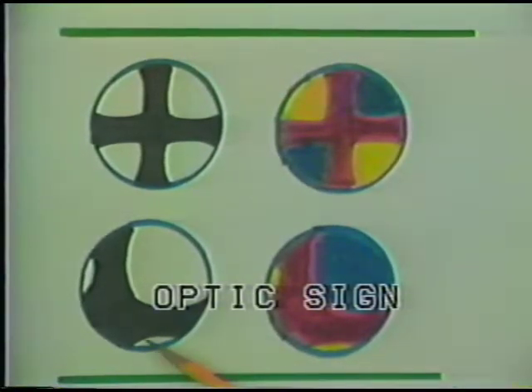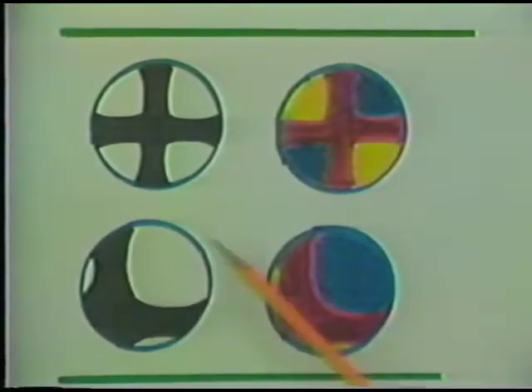If the figure is uncentered, then you want to do the same kind of trick as we did before: rotate the figure until we're looking mainly at the northeast quadrant in this particular case, and use the accessory plate, again the gypsum plate indicated here. The addition of colors, a change to blue color, indicates that this mineral is positive. If this color was yellow, the mineral would be negative.